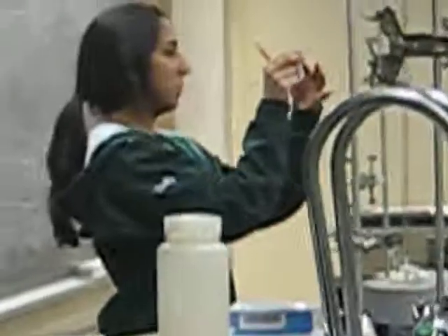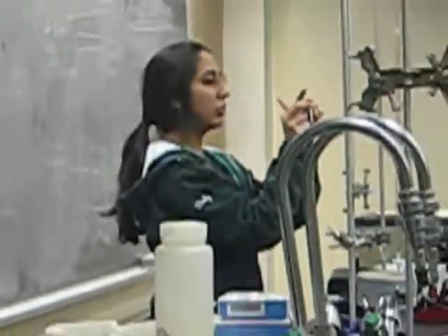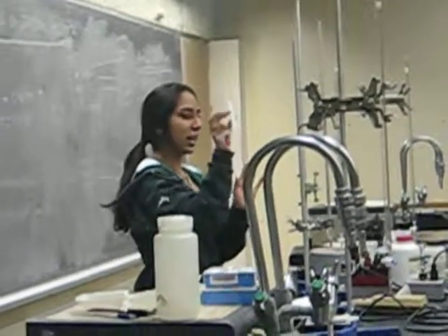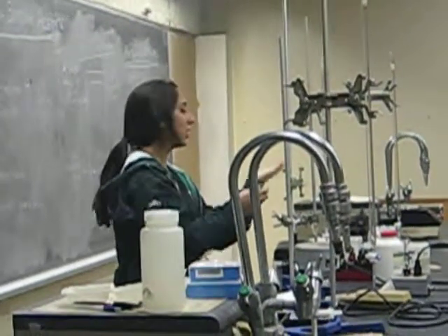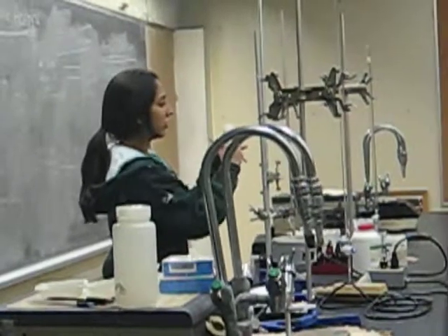Then after that, in the meantime, what you could do is take your TLC paper — this is what it looks like. It'll have a laminated side and then the paper side. You do not want to touch the paper side with your fingers. Just kind of grab it like this, or if you're comfortable, kind of just holding your hand. But make sure you don't touch the front side.